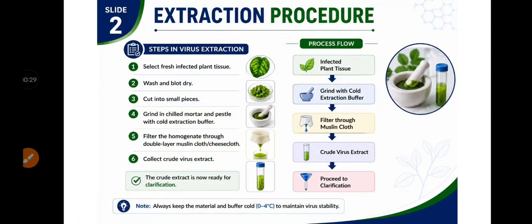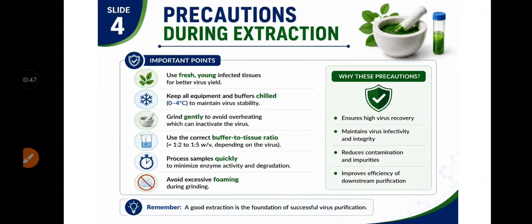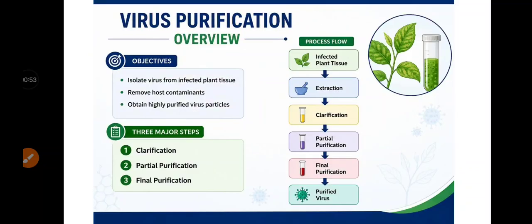In the extraction we got this crude virus extract, which will then be subjected to purification. And the extraction buffer components, we have discussed all about their function, why they are required, everything we have covered with precautions. So in today's video, part 2, we will discuss the virus purification process. So without delay, let's start the video.